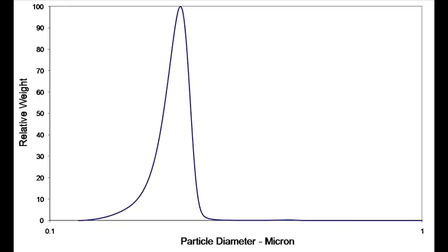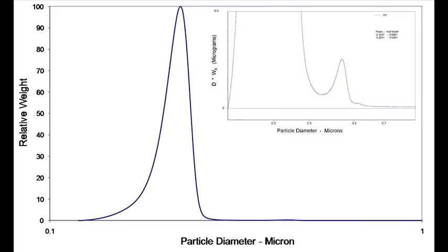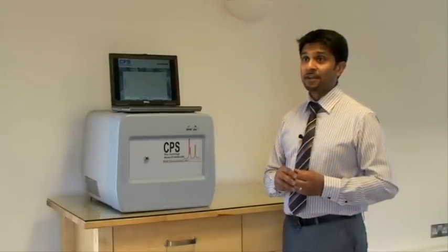We will see that we've got a very small peak at high particle size, which is almost hidden at the baseline, but this peak is real and it's representing a certain percentage of large particles, and in most cases you'll find that this small peak is more important than the actual main particle sizing peak.